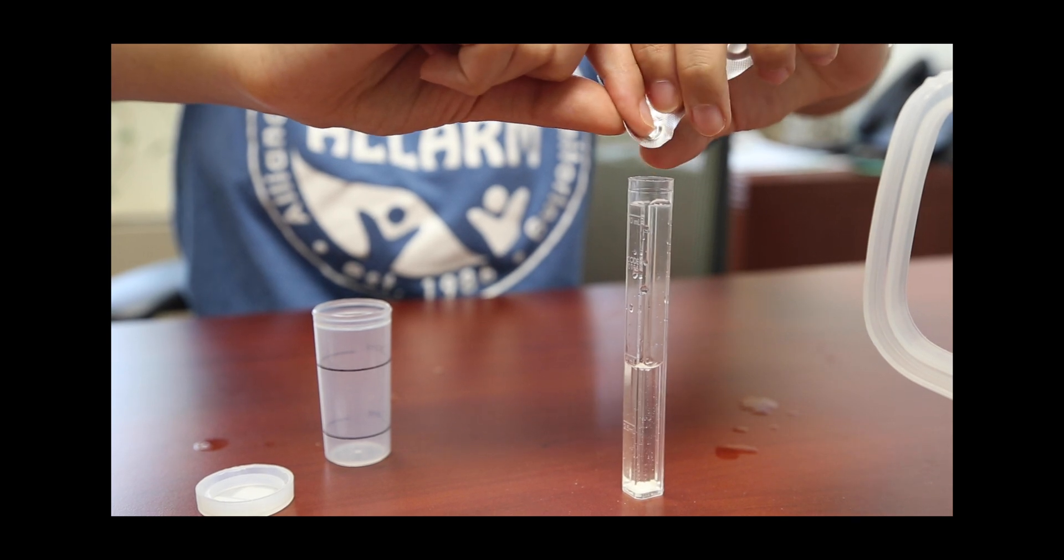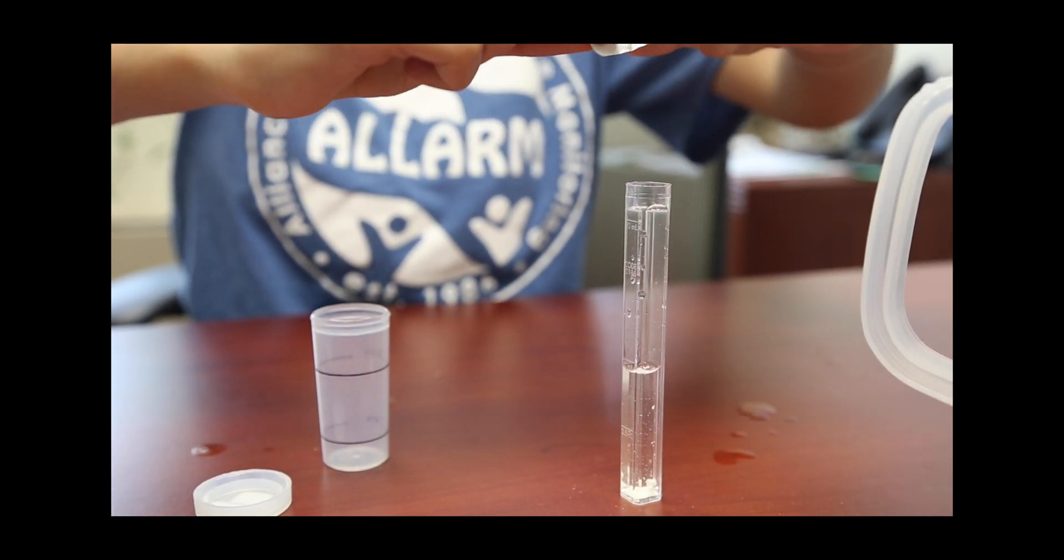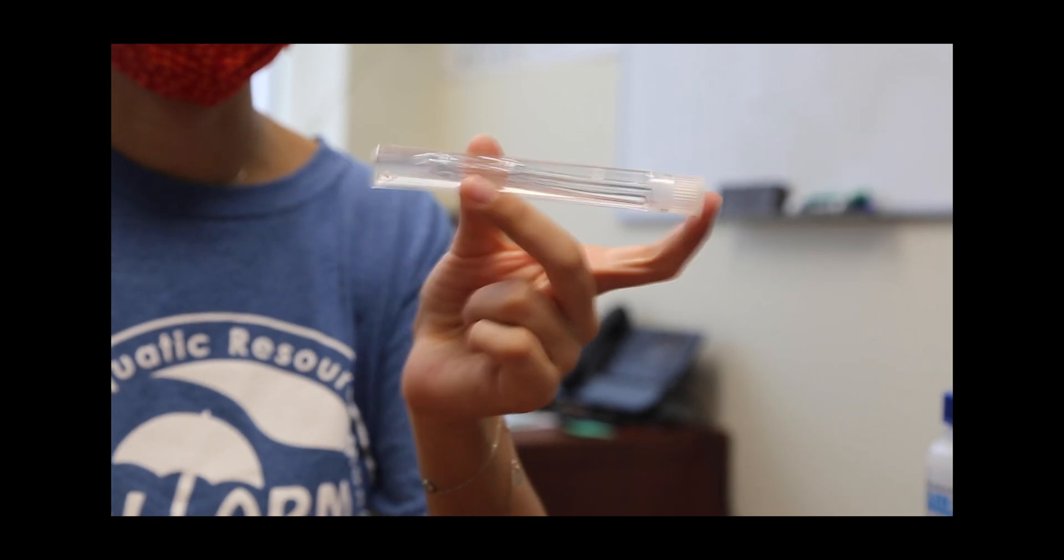Next, add the Nitrate Number 1 tablet to the test tube and cap it. Shake the test tube until the tablet dissolves, or nothing is visibly settled at the bottom. This can take about 30 seconds.